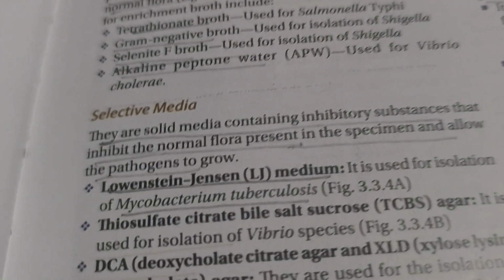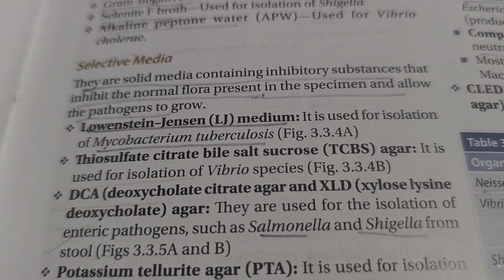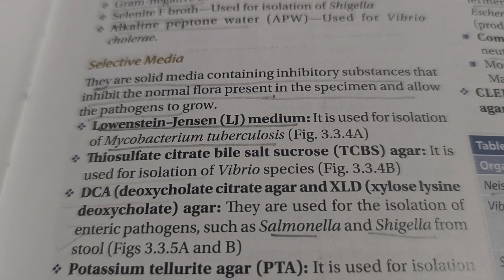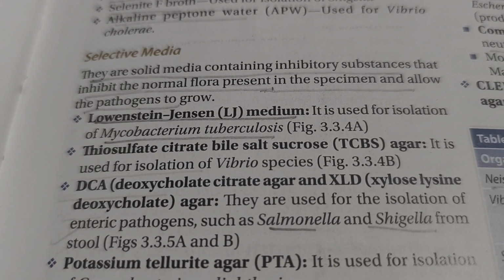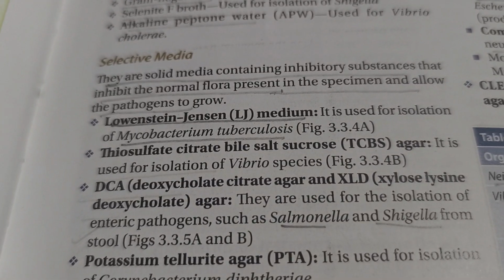Selective media. They are the solid media which contain inhibitory substances that inhibit the normal flora present in the specimen and allow the pathogen to grow.